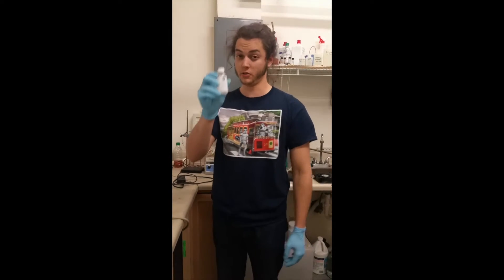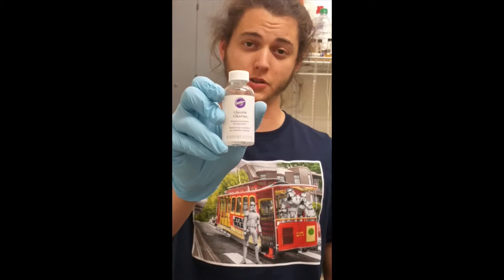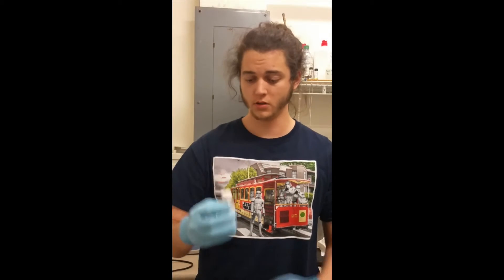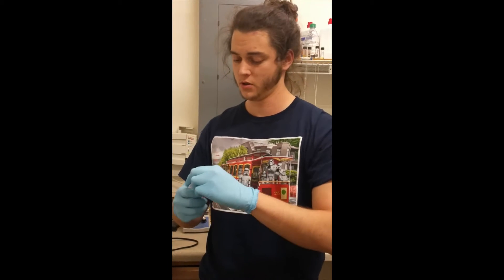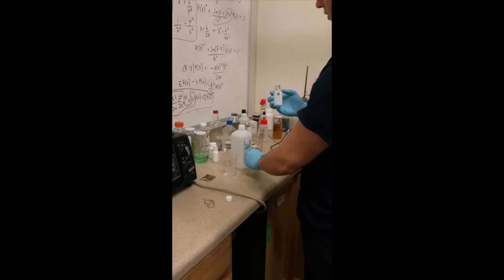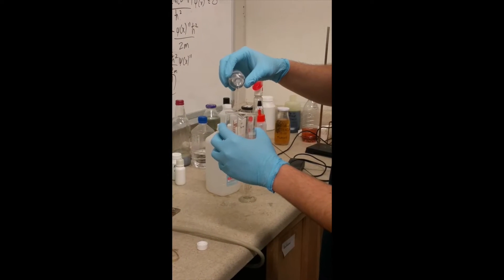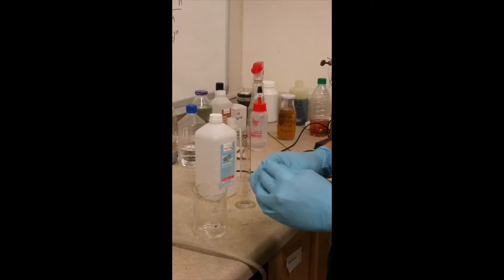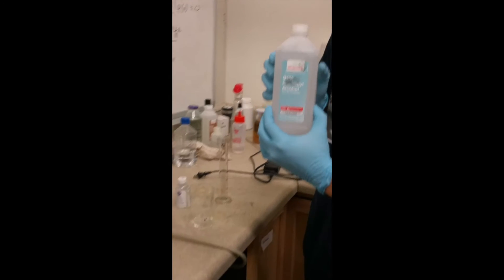So this is glycerin — actually, this is like icing thickener. You can get it from a food store, but it has glycerin in it, which is the tri-alcohol molecule with three carbons. I'm going to put some of this in a beaker and kind of guesstimate the amount — maybe like two grams here, might be closer to three grams, but I think it's about two grams.